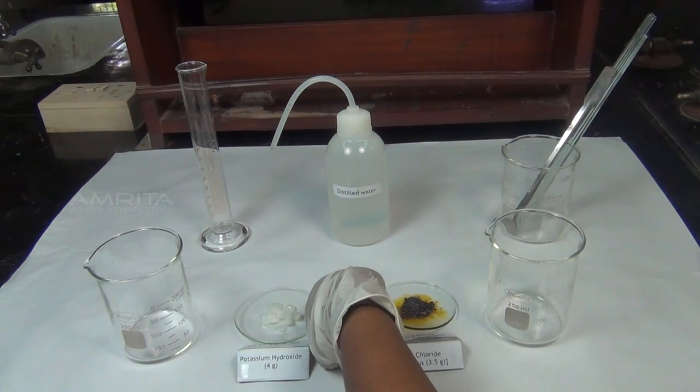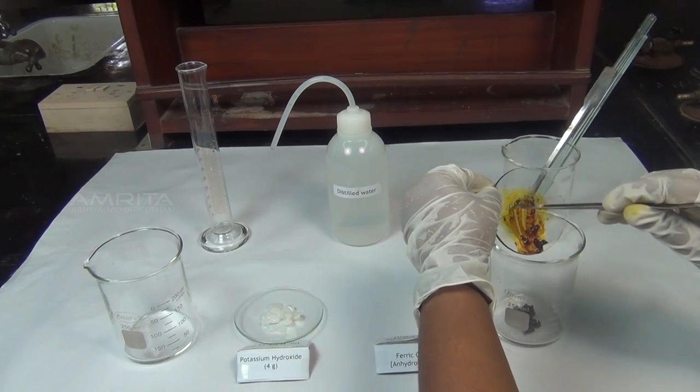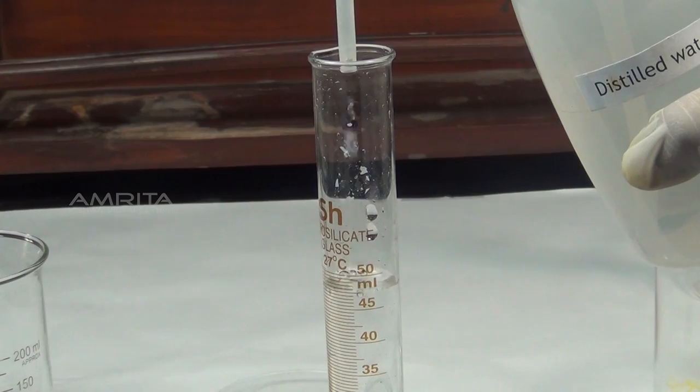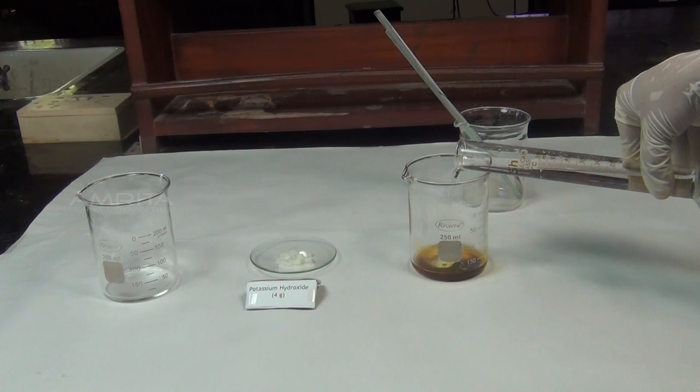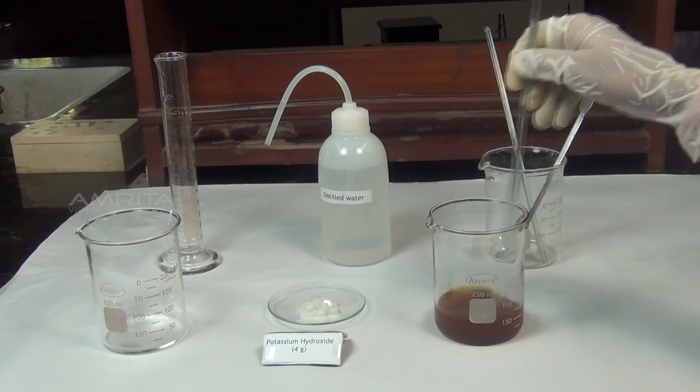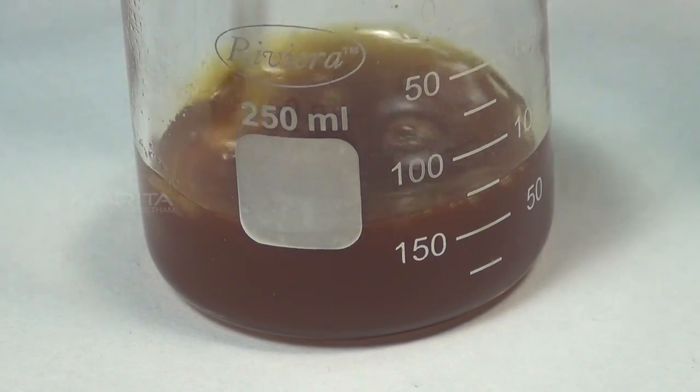Procedure: Take about 3.5 g anhydrous ferric chloride in a 250 ml beaker. To this add about 50 ml distilled water using a measuring jar. Stir the solution using a glass rod to dissolve ferric chloride.